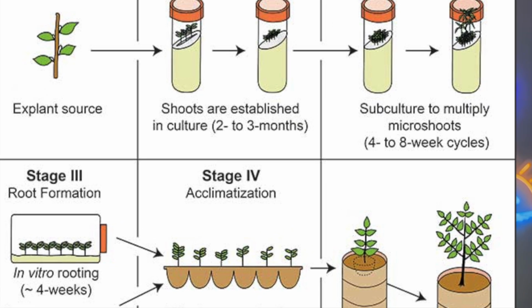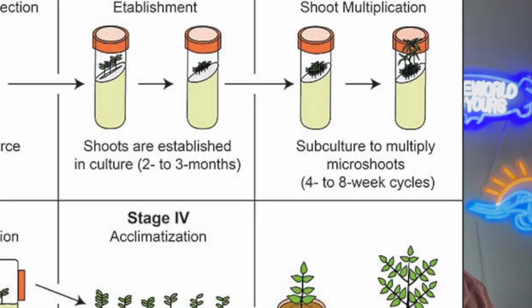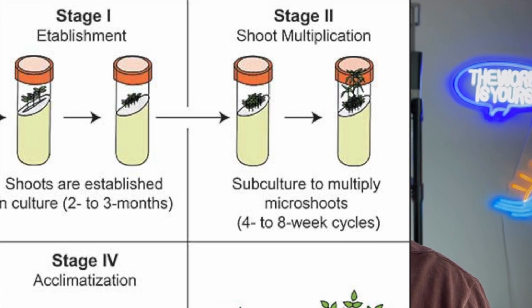Stage 2. Alright, so now we're going to talk about stage 2. And in stage 2 of plant tissue culture, you're going to really focus on multiplication and subculturing. And so what you're going to do now is create media that has plant growth regulators inside of it, PGRs. PGRs are basically phytohormones or plant hormones, and all they do in this case, we're going to be focusing on using cytokinins. There's 5 main categories of plant hormones, and we'll talk about those in another video.